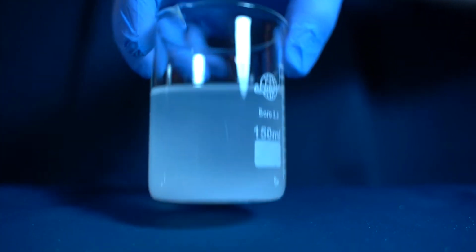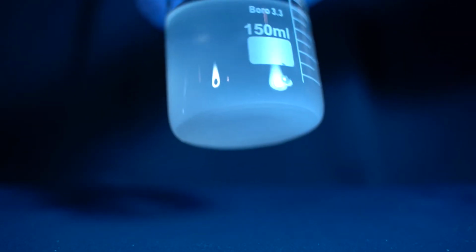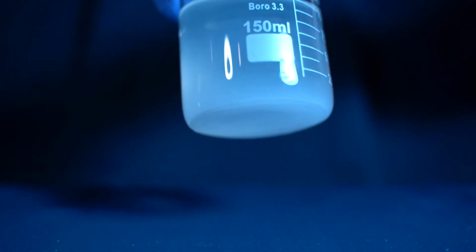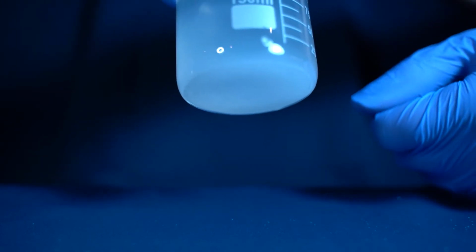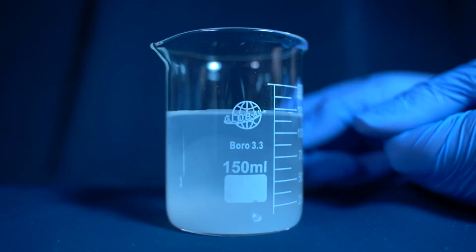Okay, so check this out. We dropped the lead nitrate, and now we're left with this cloudy white stuff in our solution. What that is, is lead sulfate. So that white precipitate that's sinking to the bottom is lead sulfate, because what happened was a double replacement reaction.